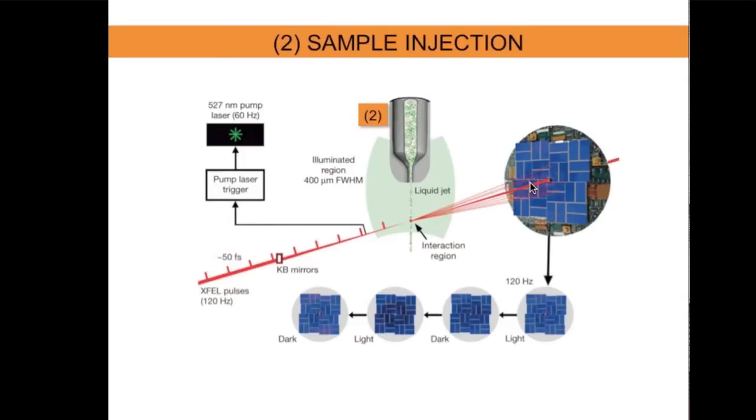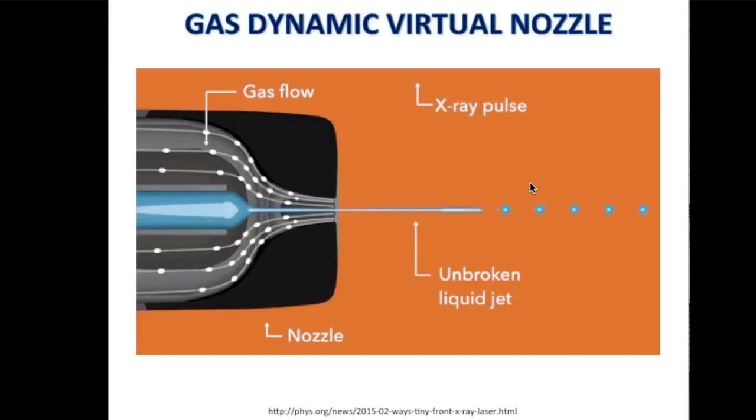Now, once you have the right crystals, the next question is how do you deliver them, or how do you help them interact with your instrument? Typically that's done in the LCLS using a liquid jet. There are multiple variations that have eventually spun off, but the idea is basically this: when you are interacting with a very intense 10 to the 12 photons in a 50 femtosecond pulse, you're basically going to destroy the material. So it's not a soft technique, it's an invasive technique. It destroys every bit of sample or solution that is around.